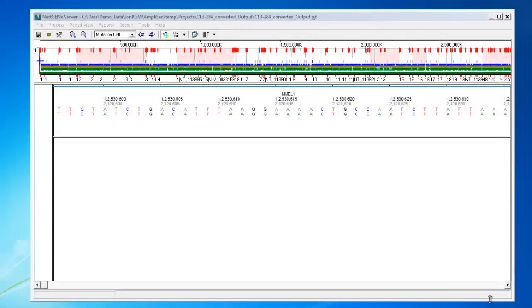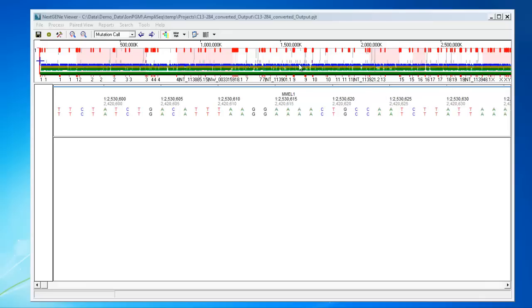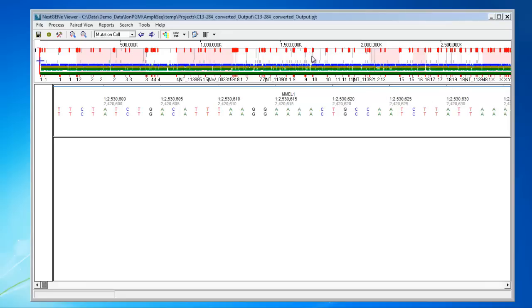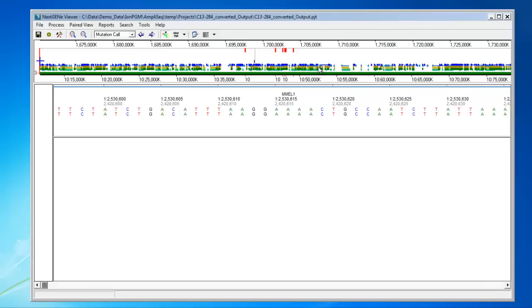Once the analysis is completed, the results are displayed in the NextGene viewer. What's shown in this top panel is the whole reference, in this case the whole human genome. You can zoom in on a smaller region by drawing a box around it.